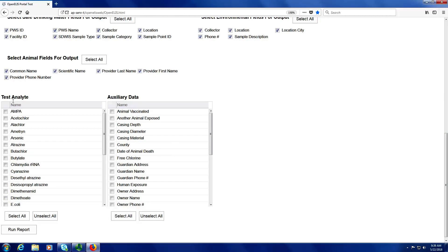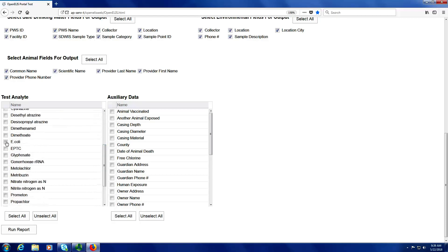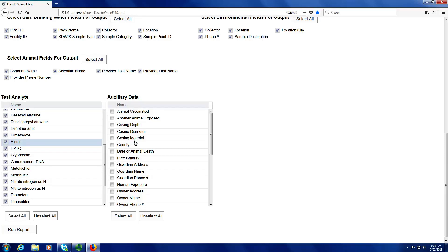Next, I have the test analytes — these are all the things that were tested by the State Hygienic Laboratory. If I am only interested in certain ones, such as E. coli, I can check that, but if I want to see all the analytes and their results, I should go ahead and click the Select All button at the bottom of this column. Auxiliary data is sample-related information — once again, I can select just the ones I am interested in, or I can select all of them. The last step is to click the Run Report button at the bottom of the screen.